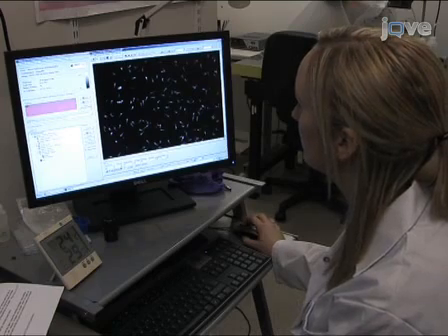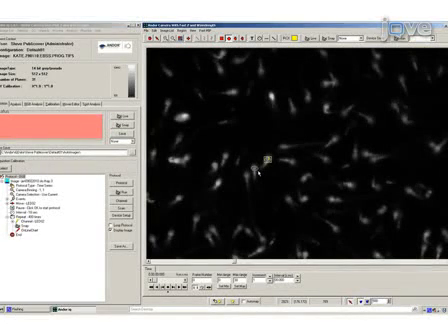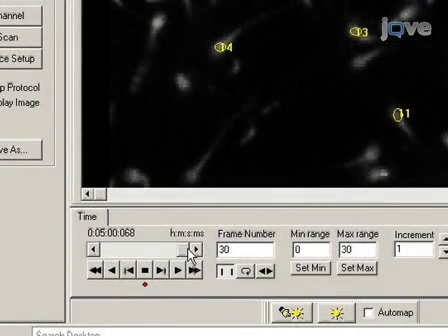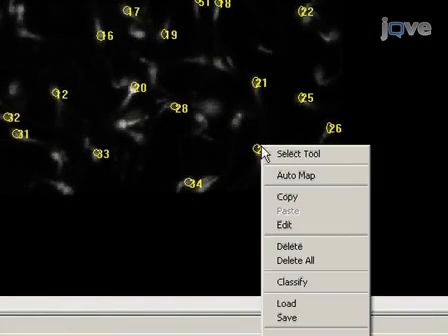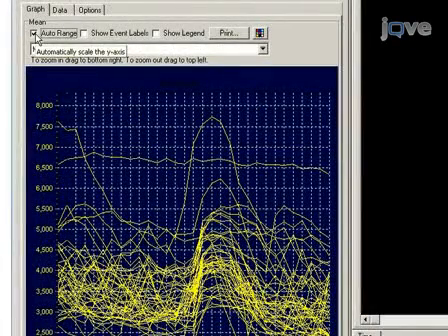To analyze images offline, use one of the drawing tools to outline a region of interest, or ROI, around each cell or part of a cell, here the posterior sperm head because stored calcium is mobilized in this area. Scroll with the slider bar to check the image series. Identify and remove cells that fail to remain fully within the ROI, overlap other cells, or have shown the large and rapid increase followed by sharp drop-off of fluorescence intensity characteristic of cell death. Use the Analyze function to generate a time fluorescence intensity series for each ROI. The data can then be exported and analyzed in a spreadsheet.